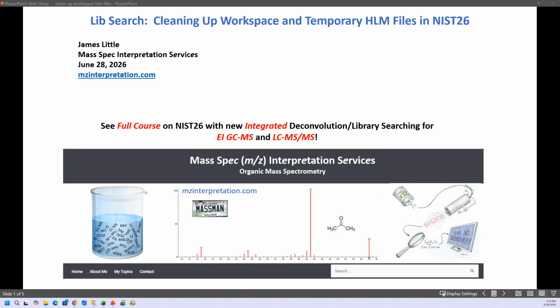This video is part of two different courses that I have on the NIST26 version 4 software, one being MSMS and the other one being EI. But whenever you do library searches with either, it's very similar in that it creates some temporary HLM files and some other files that you might want to get through when you're through doing your analyses. So I just wanted to run through that really quickly. And it's the same. I'll have to use the same video for MSMS that I will with EI because it's really the same process. So now I'll go to the software to demonstrate.